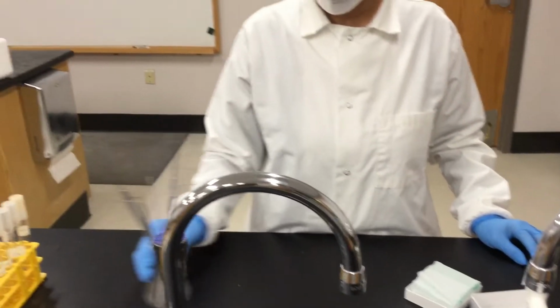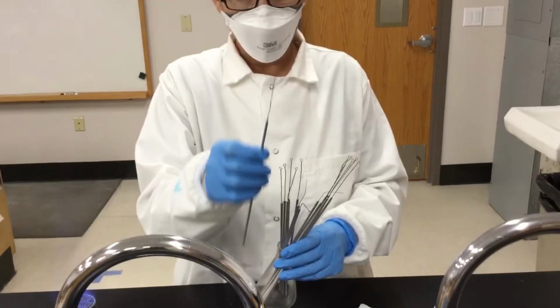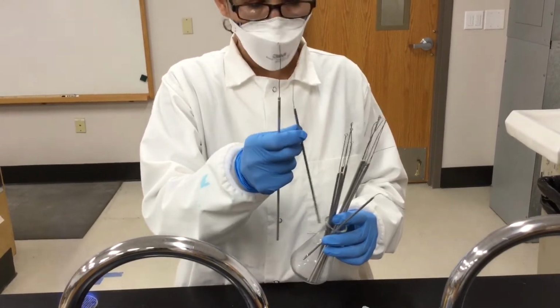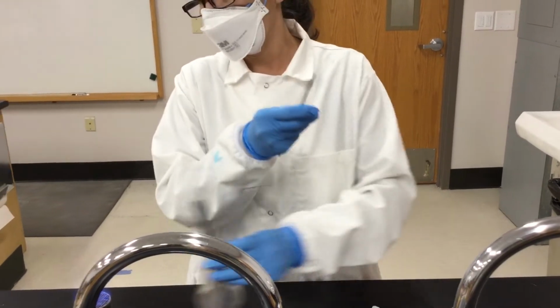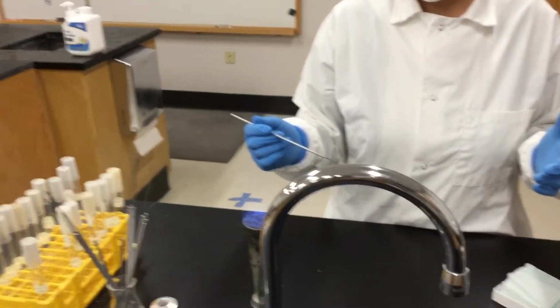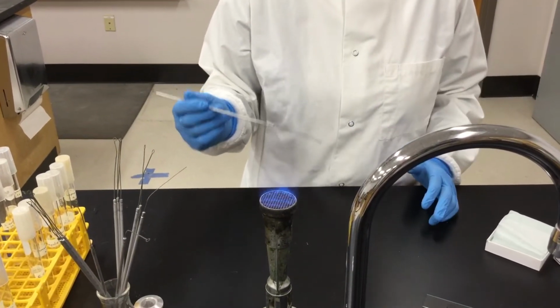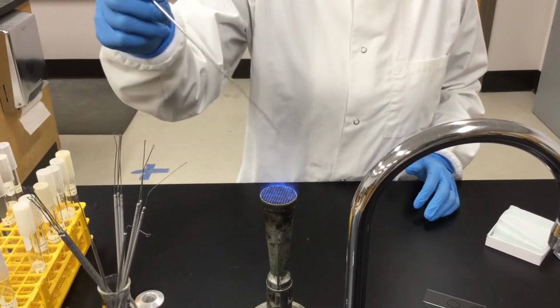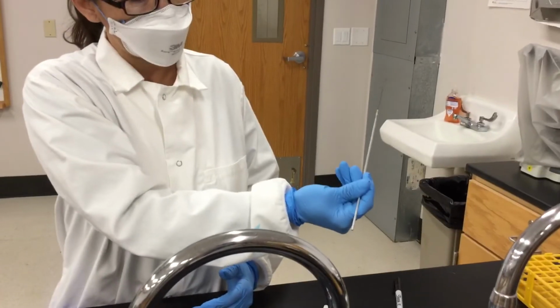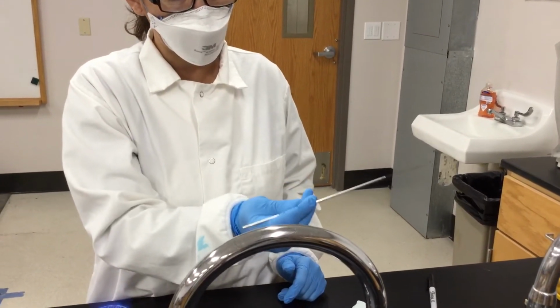And then you will have these inoculating loops. So this is an inoculating loop. It has this metal wire, and then this is an inoculating needle. Now for the stainings, you will use this inoculating loop, and then you have to use the aseptic technique. Basically, this is the sterile area. The heat is killing all the microorganisms around, and this wire you have to put in the center of the flame at a 45-degree angle, grabbing it like a pencil, with your index, your thumb, and your middle finger to make a point of support.